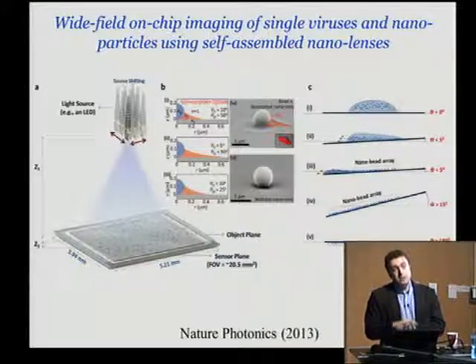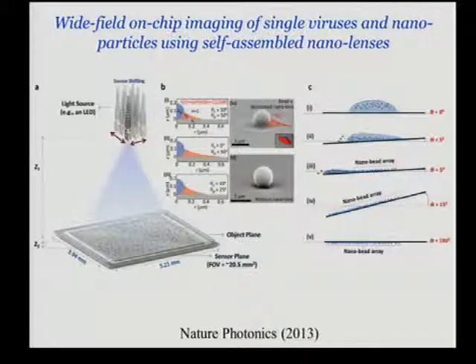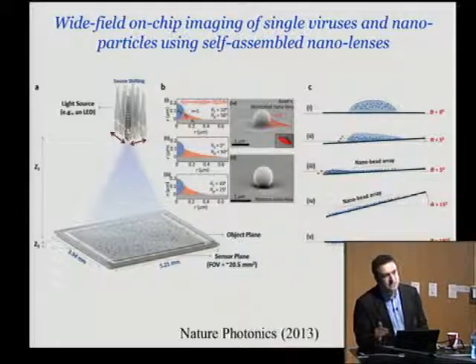So far, I've been talking mostly about pixelation, how to improve the resolution of the system to the diffraction limit, while retaining the advantages of the platform. The other important feature of an imaging system like a microscope is its sensitivity. You can claim a resolution that has a very large NA, but your detection noise will determine what kinds of small features you can ultimately detect. So resolution is an inherent function of signal-to-noise ratio in any imaging system. This is true for this kind of a modality too. To see smaller things with this kind of a geometry is even more challenging because it's trying to see the moon on a sunny day.